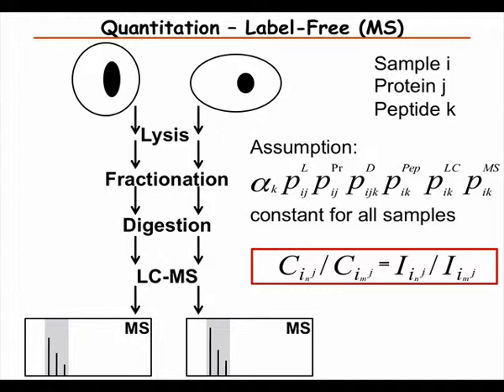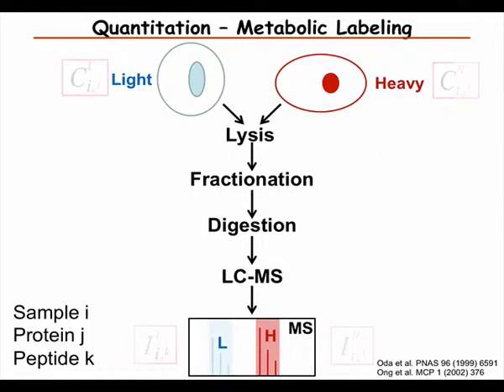Let's say it has a post-translational modification, that would of course give rise to an outlier. But in a lot of cases, people don't really know what's going on. So a simple solution is you take the median of all the peptide ratios. And so far it's still an ongoing discussion how to do it.